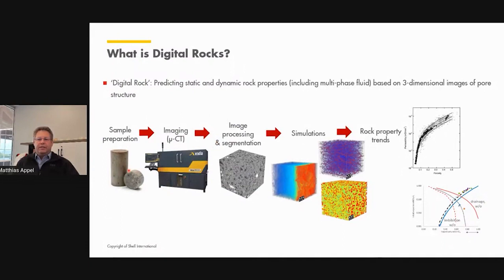As I said already, we get these beautiful images. Here is an image of a classical micro CT scanner. They're called benchtop devices, but to be honest, it weighs about a ton. So you need to have a pretty strong bench to run it. And the one you have in the LRAP lab, the Cortom, is whatever, 5 times that weight, I would say, or 3 times that weight.